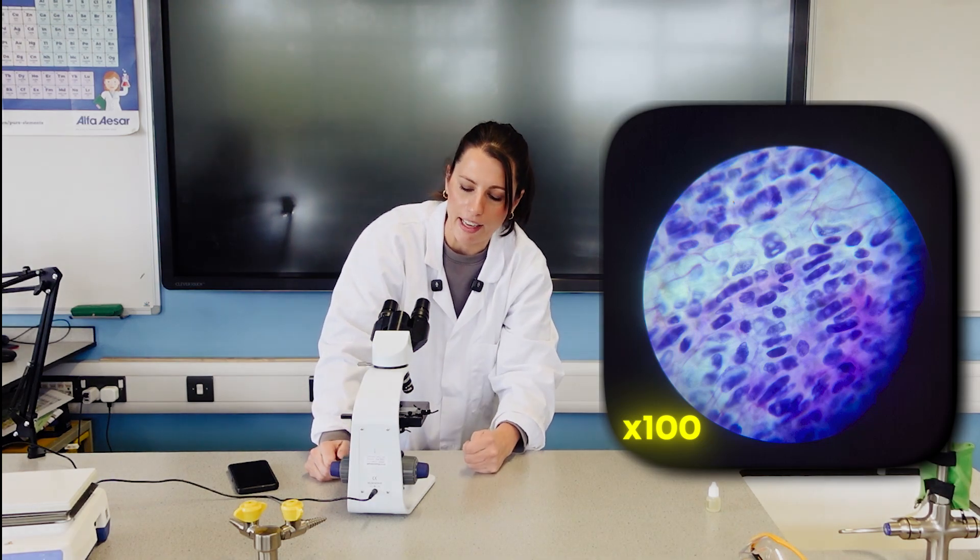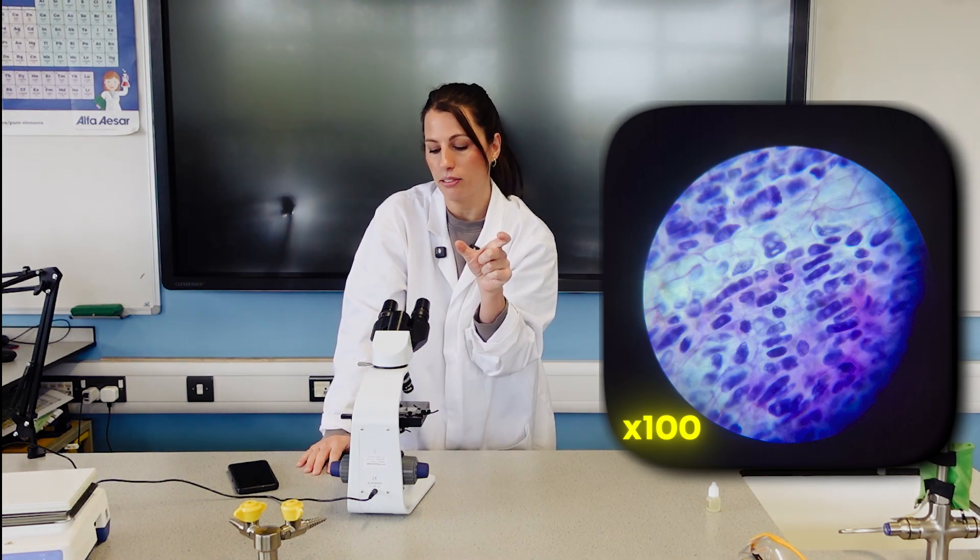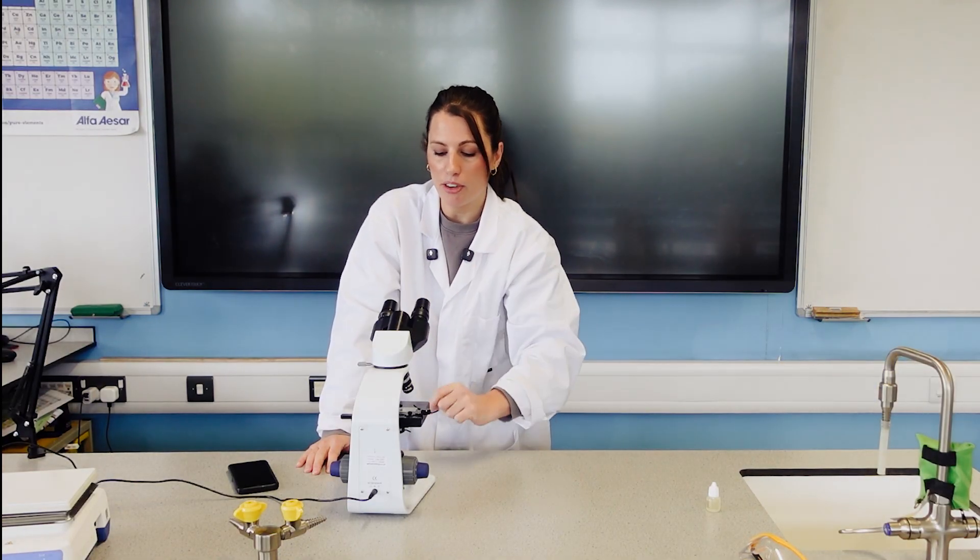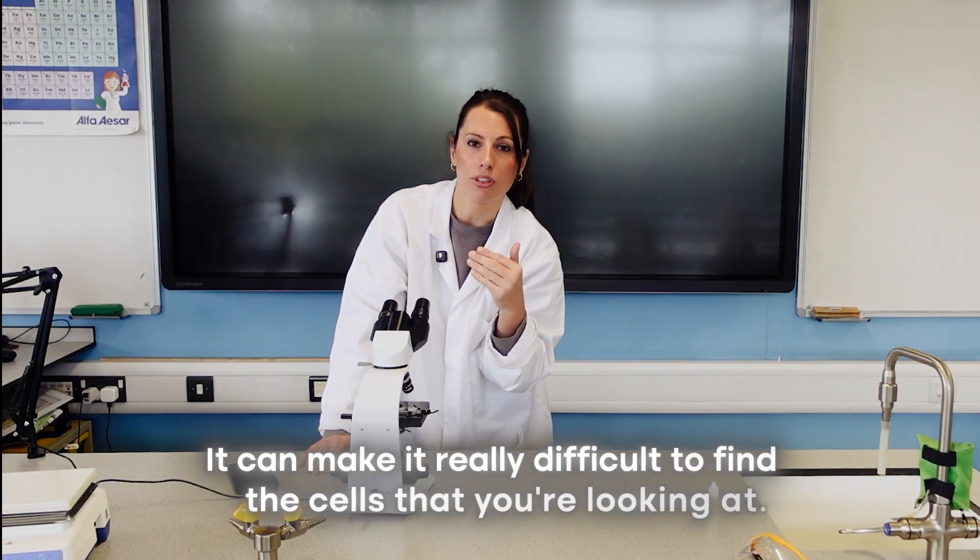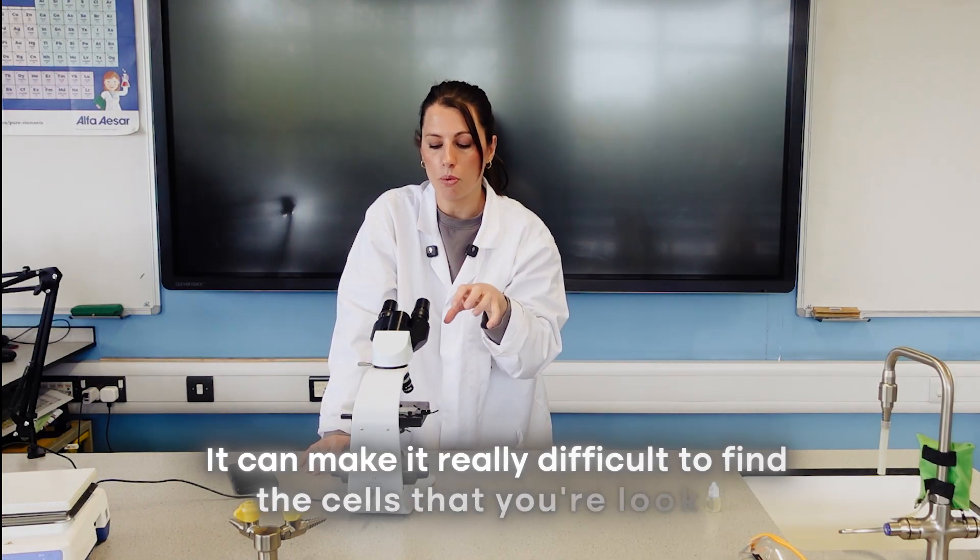So what I was just doing then, because I took the slide out to put the oil on, when I put it back it must be in a slightly different position. When you're at that high magnification it can make it really difficult to find the cells you were looking at.